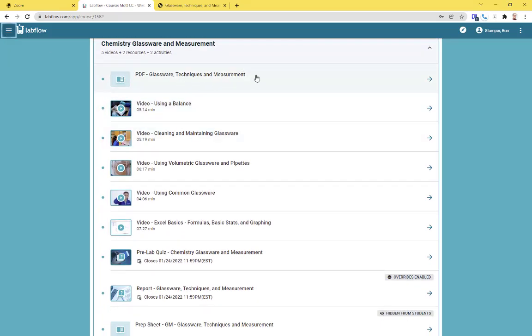I would have read through the PDF instructions first. Then there are a series of videos here. A short video about how to use a balance appropriately, a short video about how to clean and maintain your glassware, one about common glassware, and one about volumetric glassware, and then a short video about how to do basic statistics in Excel, because this lab has a small graphing part to it. Then there's your pre-lab quiz.